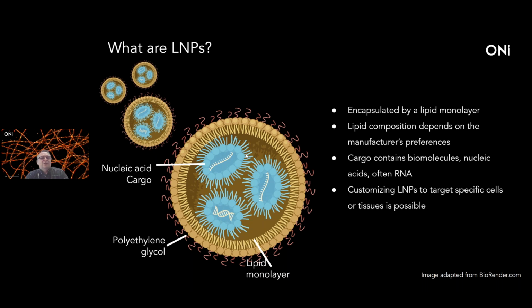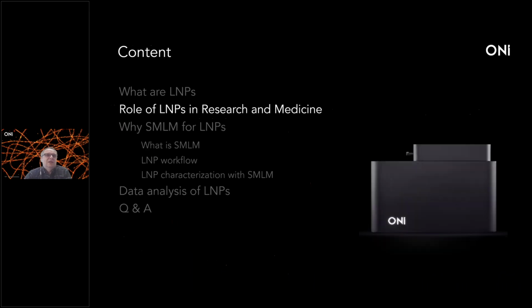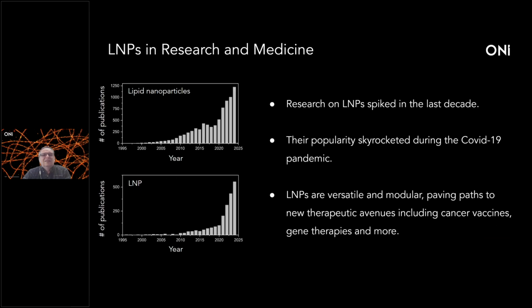So this is just a brief introduction of lipid nanoparticles, but what is the role of these particles in research and medicine? How much do we actually know about that? Lipid nanoparticles are starting to be widely used in research. If you look at the number of publications by searching lipid nanoparticles or LNP, you can see an increase in publications towards this year.